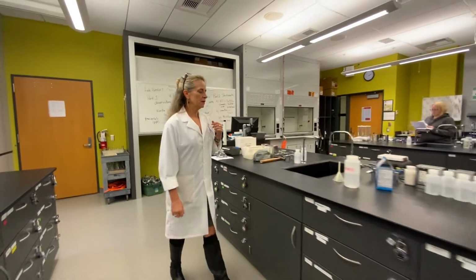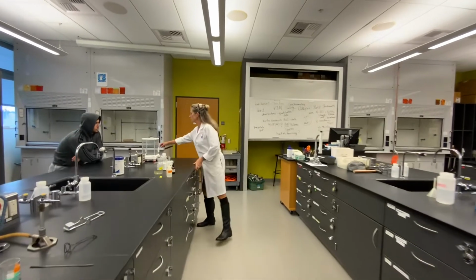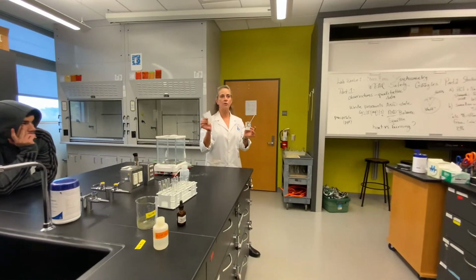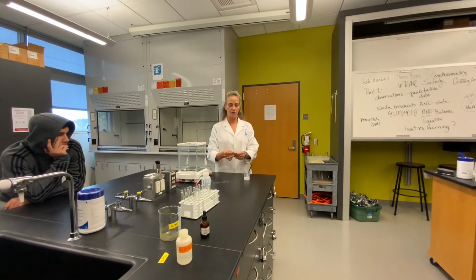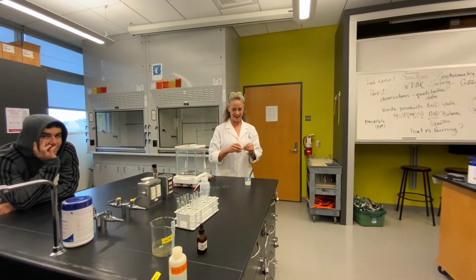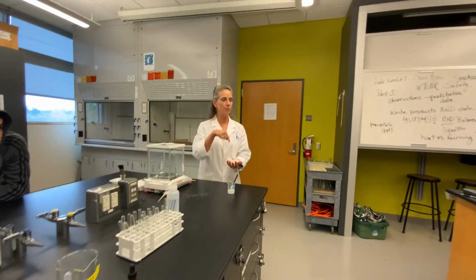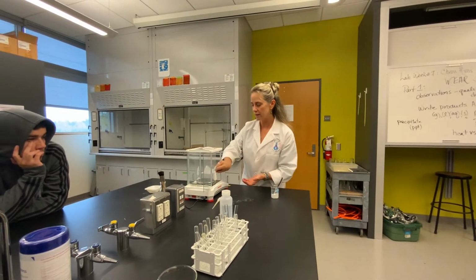So you are going to use sodium bicarbonate. The very first time, you're going to have your sodium bicarbonate and your weighing paper, and you guys have weighed enough things now where I feel like you know what you're up to, right? This goes on the balance, and this time I really do encourage you guys to fold it in half. Why are you laughing at me? You're smiling. Okay, so fold it in half and just make yourself a little weighing boat. It's easier that way, and the paper is really useful because it's going to help you get it into the Erlenmeyer flask. So on the balance it goes, right?